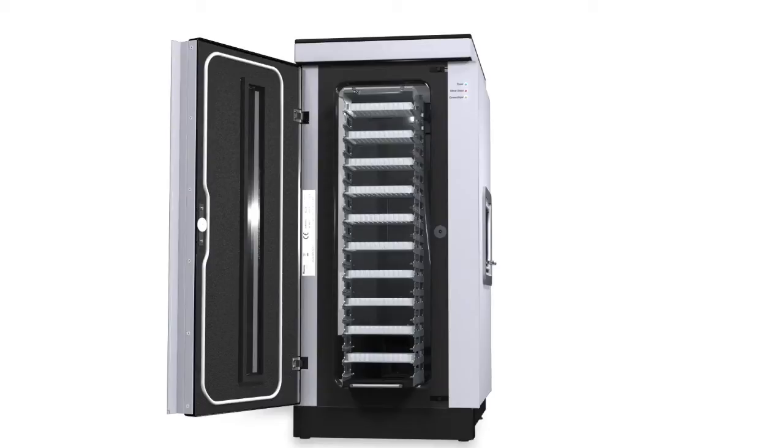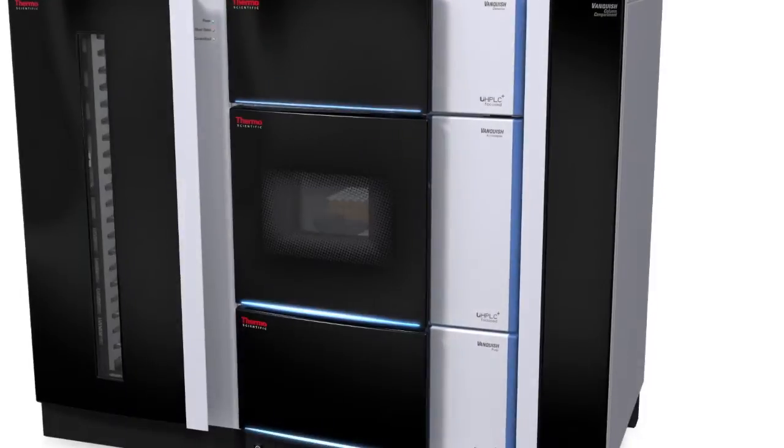Use 384 well plates to increase sample capacity up to as much as 8,832 samples, meeting the needs of the most demanding high-throughput laboratories.